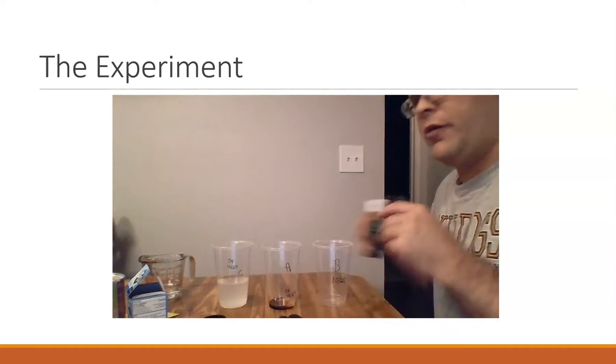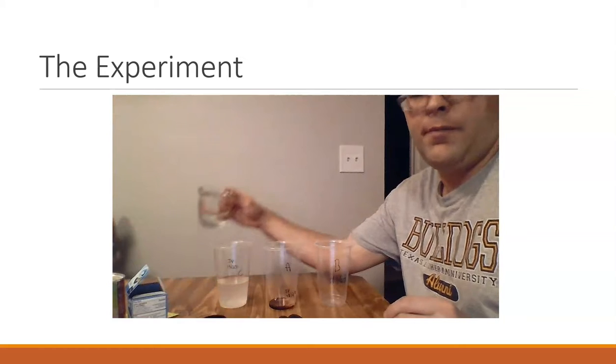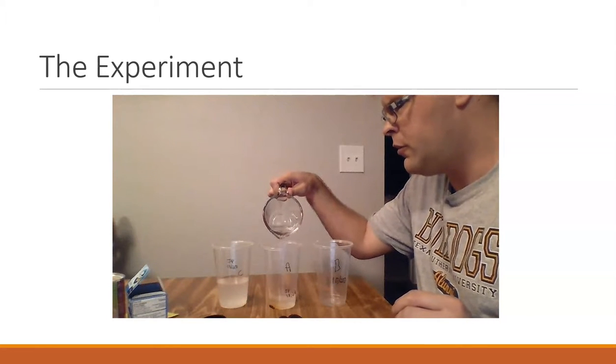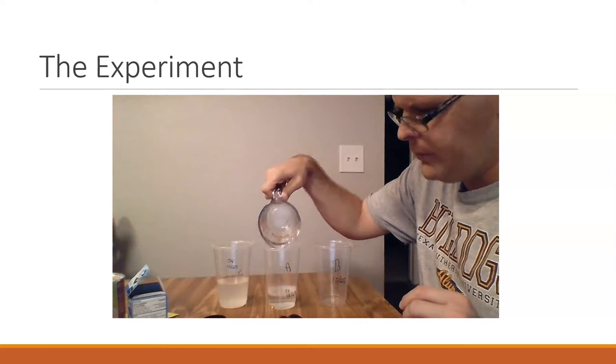And then our 2 ounces of water. Note the change in the color.